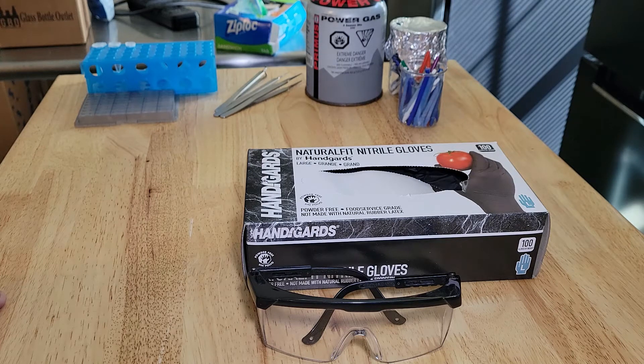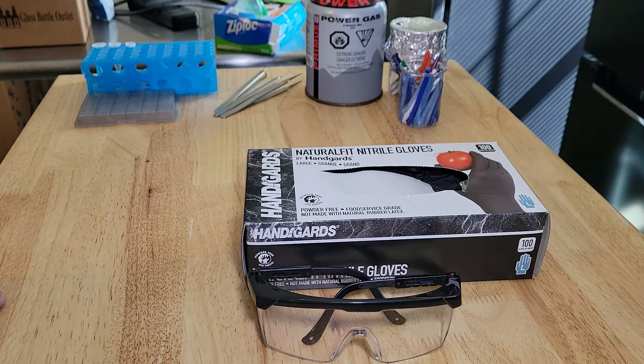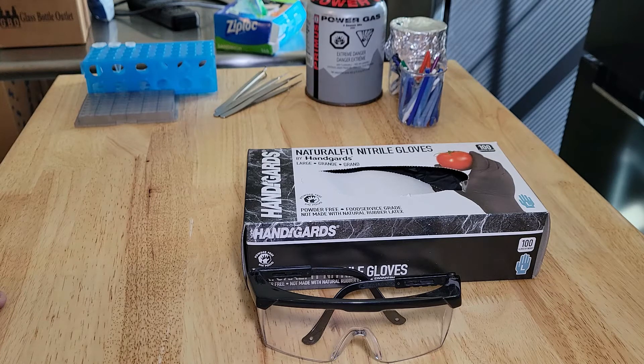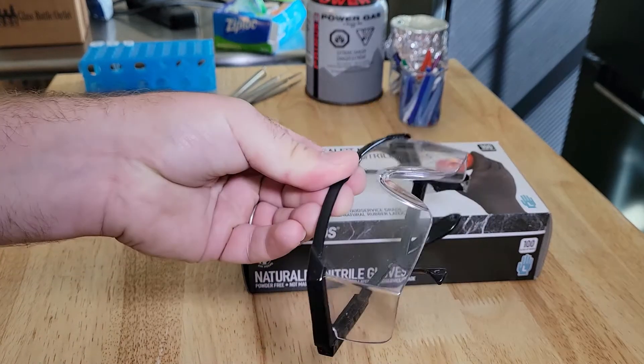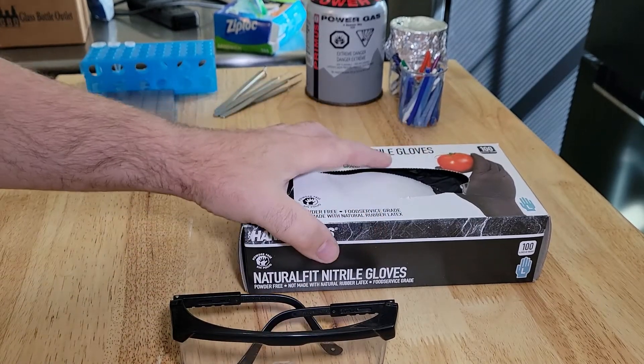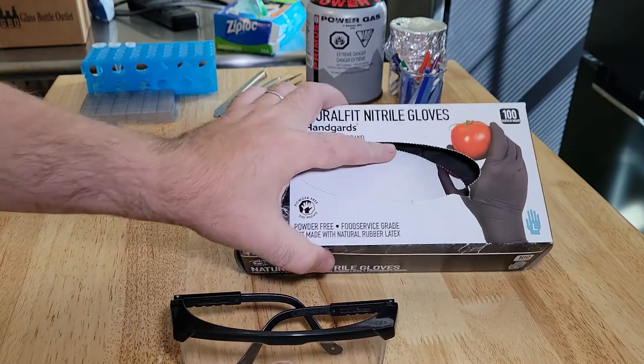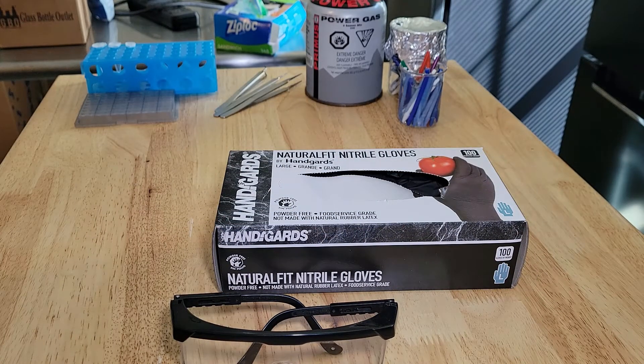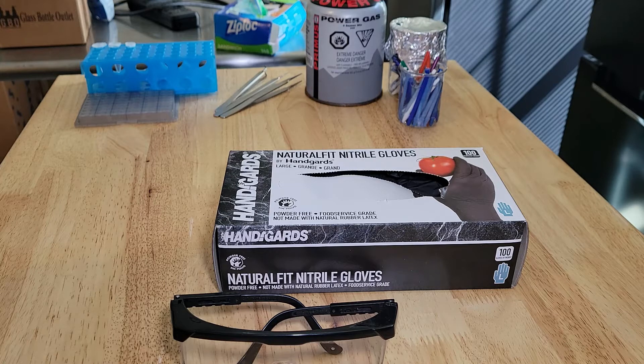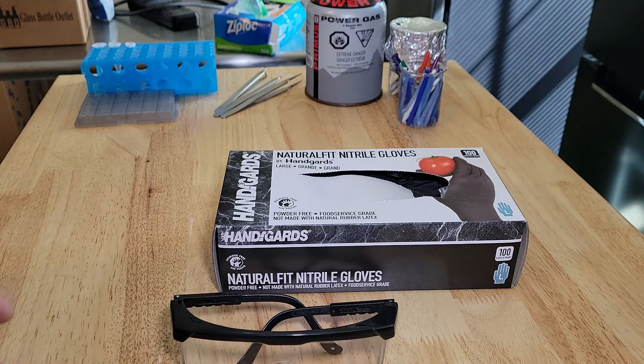The first step in all lab work, whether you're in school or at home, is safety. Make sure you're wearing your safety glasses with splash-proof sides and nitrile gloves. Those will protect you from the bleach we're going to use. The other chemicals we're using are not particularly dangerous, but you want to be safe anyway.